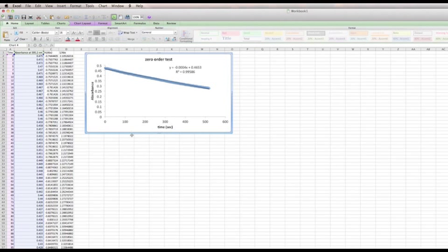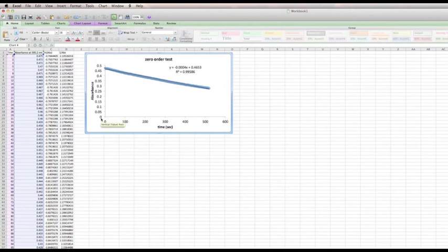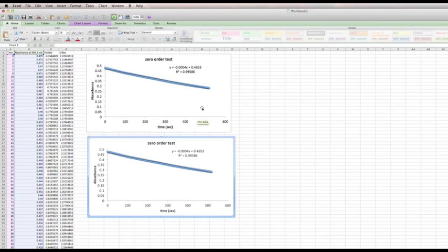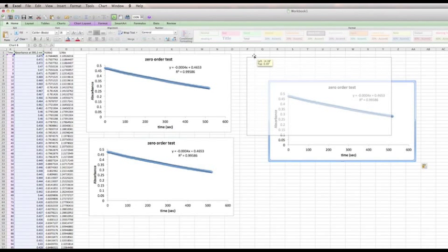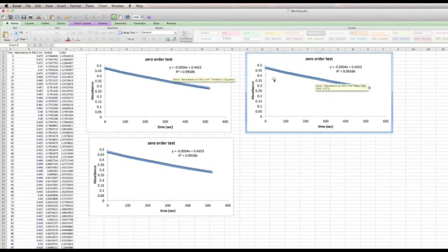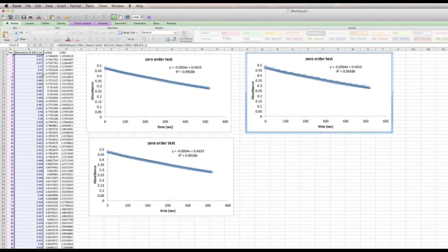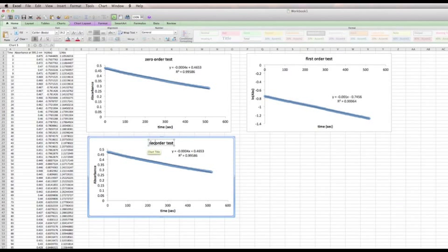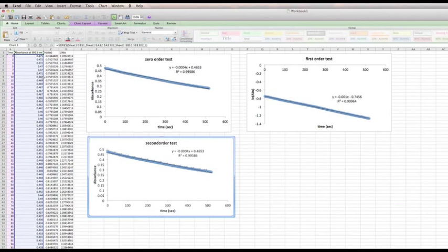Once you make one graph, it's really easy to make the others — just copy it, click off the graph, and paste. Go ahead and make three of these total. For the first-order test, move the data over one column and change the y-axis from absorbance to natural log of absorbance. Change the title to 'First Order Test,' and then for the second-order test, move its data to the one-over-absorbance column.